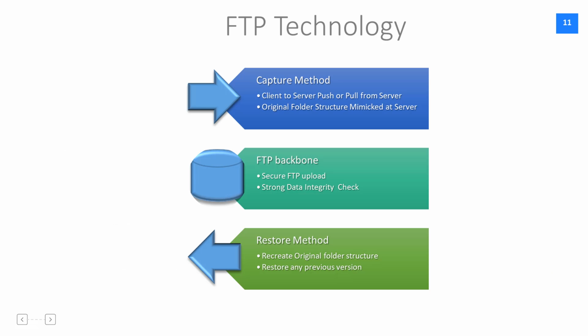LogiLab SDMS uses FTP technology as the backbone for storing all its data in a central repository. The instrument data capture method can be push or pull. There are several instruments where LogiLab SDMS monitoring services cannot be installed. Let's say, for example, the old XP operating system.